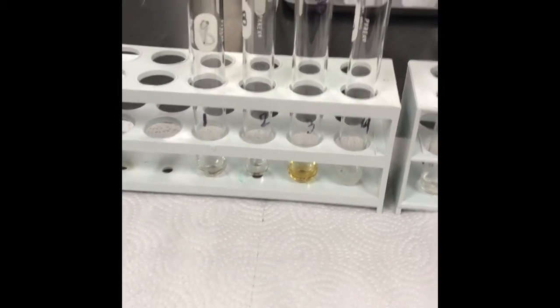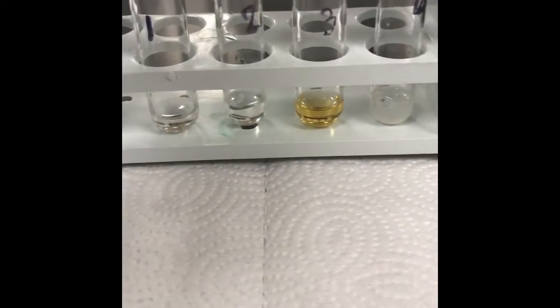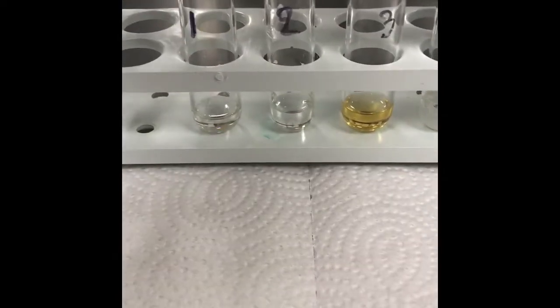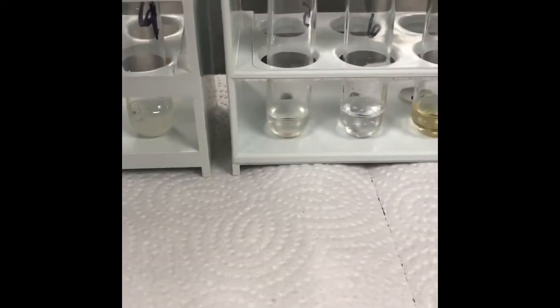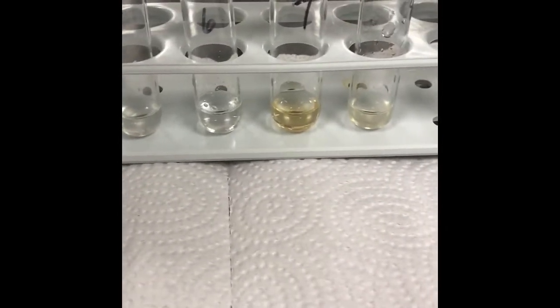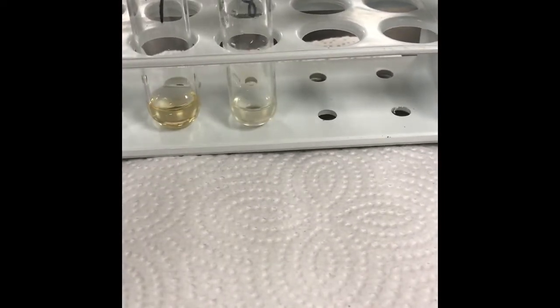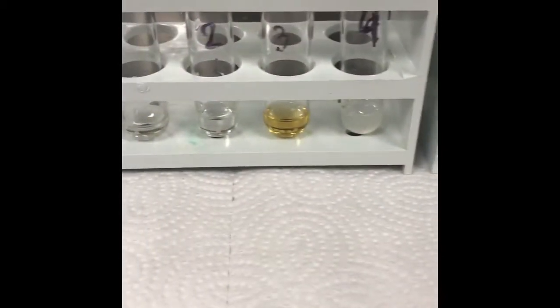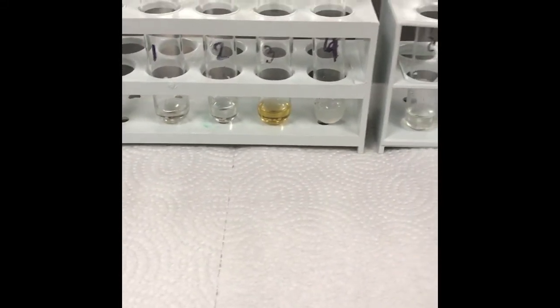and stains them a shade of purple or black. So right now you can see the color, and you don't have to note the before color, but I just want you to see. Test tube 1 and 2 are clear. 3 has that little tint to it because it's apple juice. 4 is egg white. 5 is white potato, with a little tint to it. 6 is gelatin, and then we've got honey, with sweet potato at the very end. So we're going to add the iodine, and if they turn any shade of black or purple, that's going to indicate the presence of a polysaccharide.